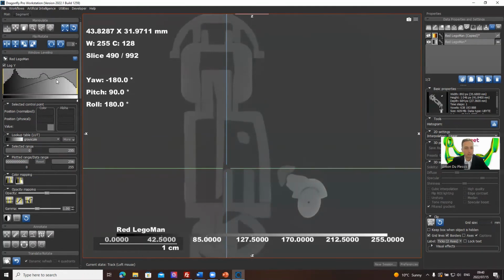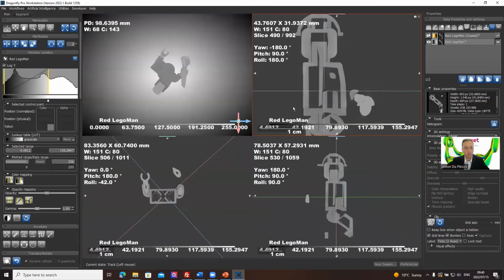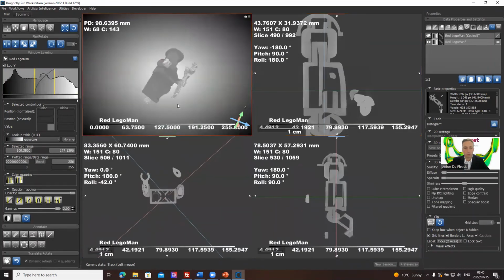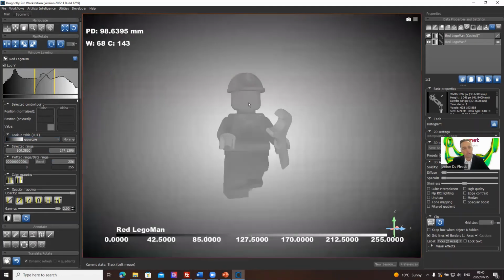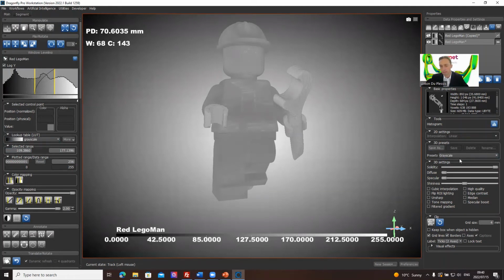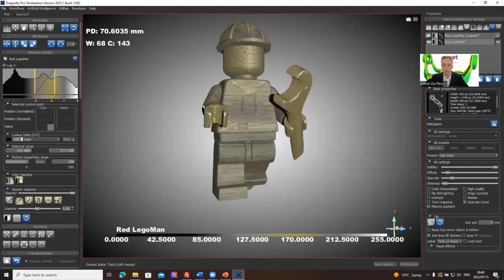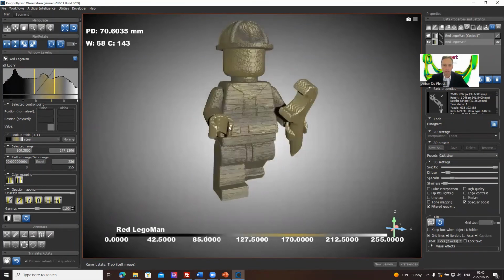Right, so this is where the contrasting takes place, and the important thing is that you understand that the 2D and 3D contrasting and rendering settings are separated. And although the 3D rendering tools are possible on the left, the main functionality is on the right under the 3D presets here, and changing these settings here. So you can use both, but it's quite useful to use some of these preset tools like this. So this is quite nice.